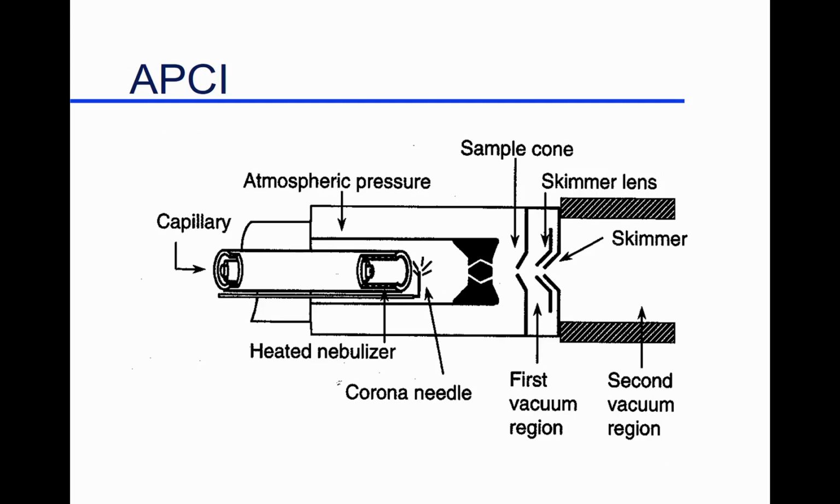This is a different inlet, one that I happen to like and have used a fair amount. In my case, there isn't any kind of an LC attached to it, but there certainly can be. And so this is at least under atmospheric pressure, which is kind of interesting, but it's the same type of system, where you will draw, in this case, gas in potentially.